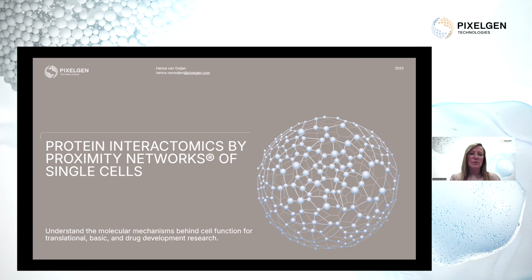And I plan to go through a little bit of background into how this technology works and what kind of output we provide. We have a lot more information on the website. There was recently a webinar really going into depth about the technology and the workflow, etc., that you can also access on our website and on our YouTube channel as well. So we will keep that part a little bit brief and then really focus on the results on CAR T cells.